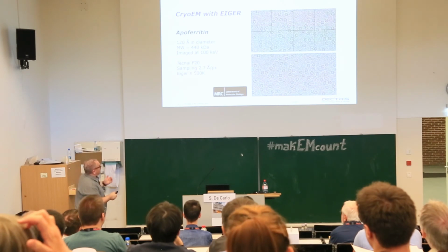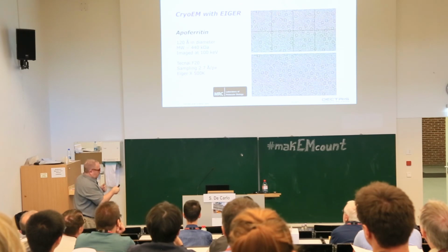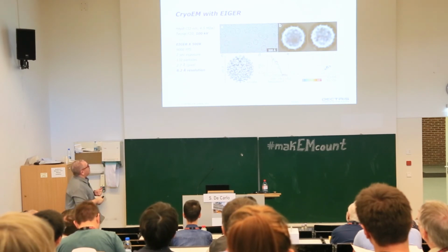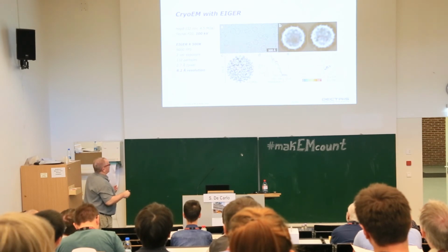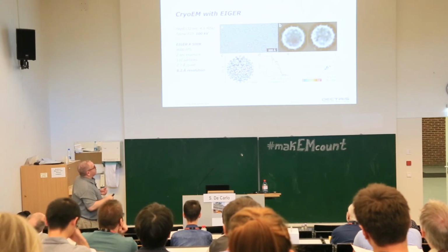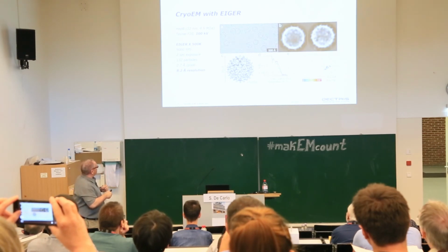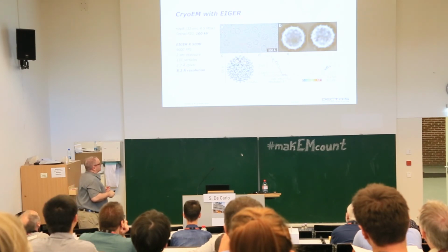So what they did is collect data on a Tecnai F20, but reduce the high tension to about 100 kilovolts. And they tested this, as you will see in the paper that is coming. They tested several data sets. The largest macromolecule was hepatitis B capsid virus. You can see here an example. Of course, with the reduced field of view, you have only a few viral particles, so you have to collect a bit more data. And at the end, with a 2.7 angstrom sampling per pixel, they got about 8 angstrom resolution.